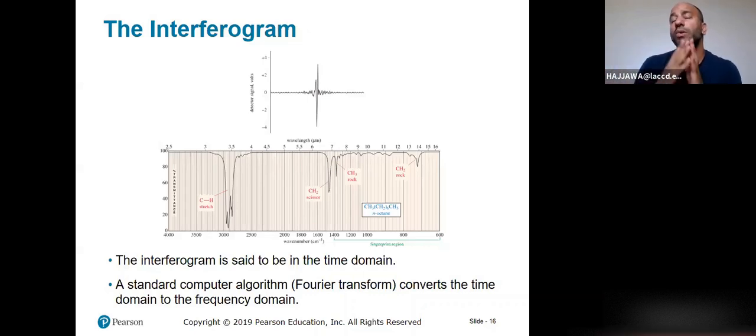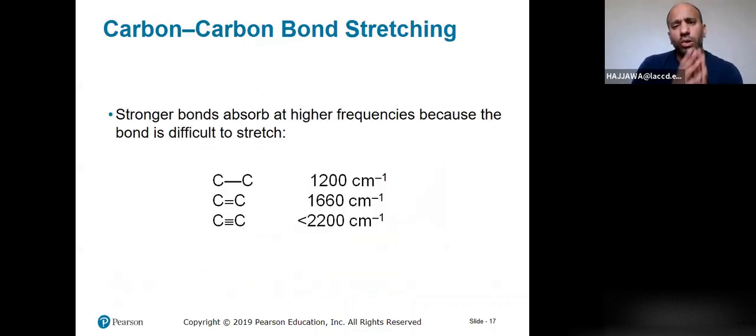Also, when it comes to the bonds, single bond versus double bond versus triple bond, the shorter the bond, the more energy it's going to absorb. That's something you're going to notice within the readings that we're going to go over. A lot of chemical compounds we're going to visit. We're going to look at each category and find out the most important frequencies we have to be aware of. So let's start with hydrocarbons.